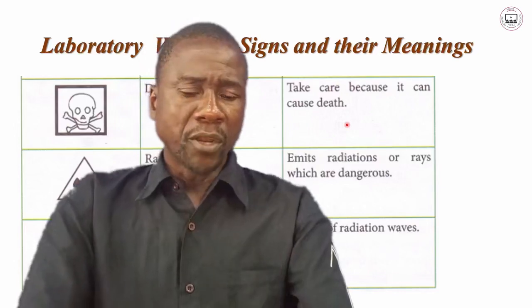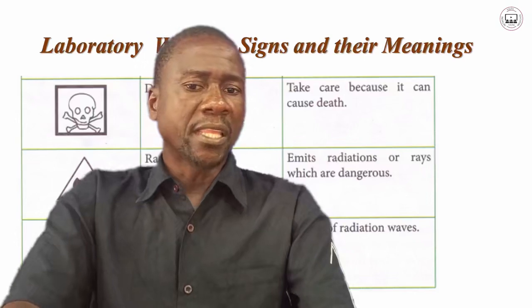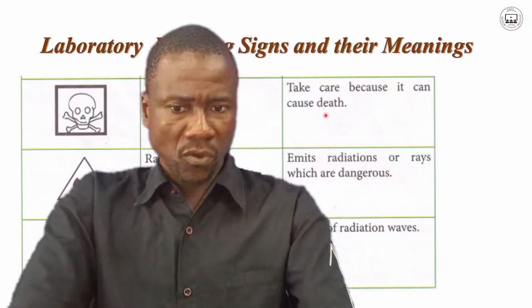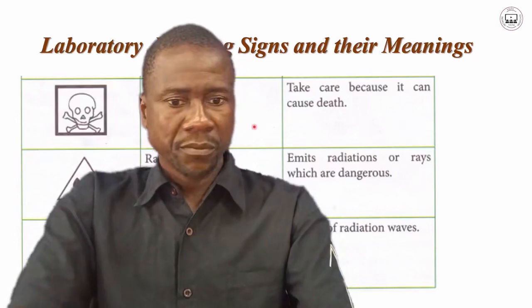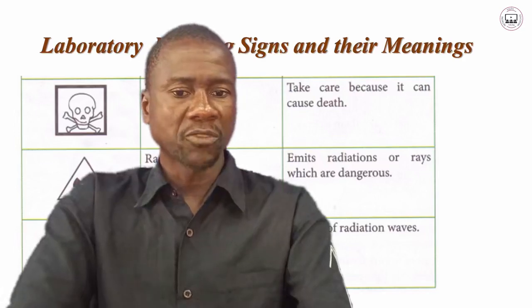Meaning, when you are handling materials with this symbol, they are telling you that they are dangerous. You may lose life because of the same materials. And there is another symbol which looks like this. This is a radioactive symbol. So it's a warning sign as well.